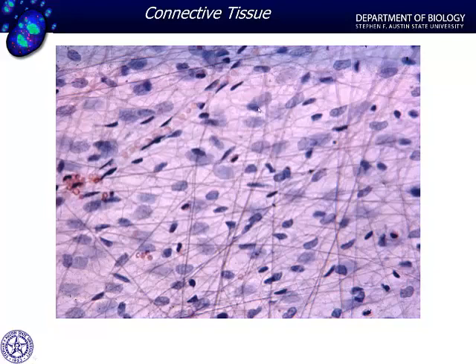And when we get to the blood vessels again, remember, we're going to identify this as the endothelium of the blood vessel. Now, you can see this nice stellate nucleus. Once we move away from the blood vessel and we see this oval-shaped stellate type nucleus, we're really having a hard time seeing cell boundaries here. These are going to be the nuclei of our fibroblasts as they're running throughout this tissue. The larger cells are likely going to be mast cells and macrophages.